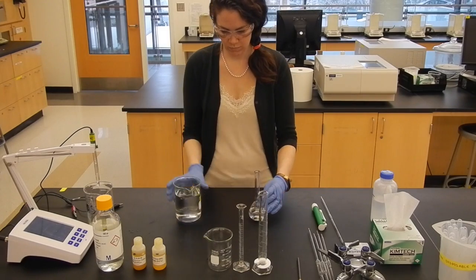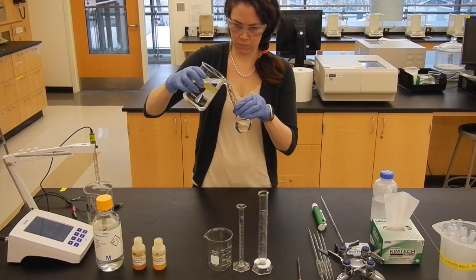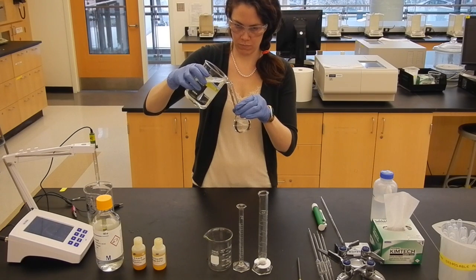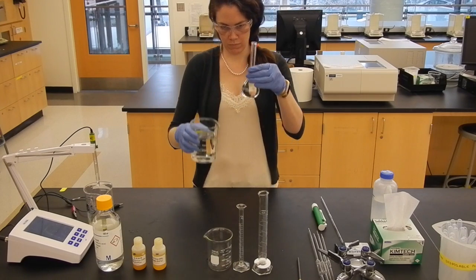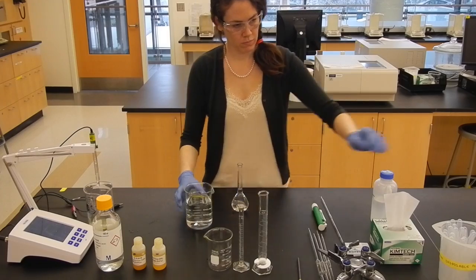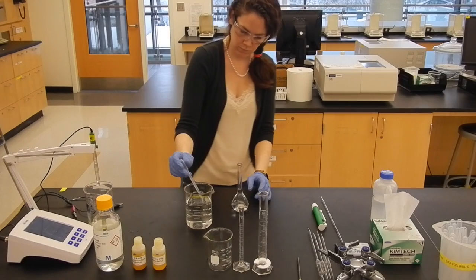This means that we do not force the liquid out of the pipette. To complete this solution, fill the volumetric flask just to the line with water. We want to be extra careful not to overfill the volumetric flask, or we will no longer know what the concentration of the solution is and will have to remake it.